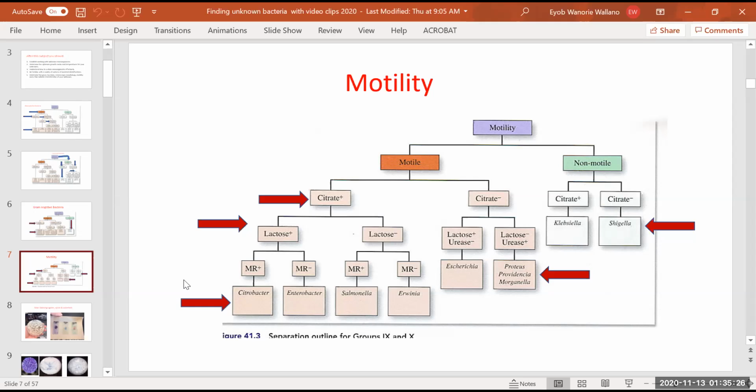So in gram, we focused already. On motility, we focused already. After that, what we are going to do is the fermentation process. Okay, now, here, look now. Because of the gram stain, spore stain, acid fast stain, we know something. What are you going to know?